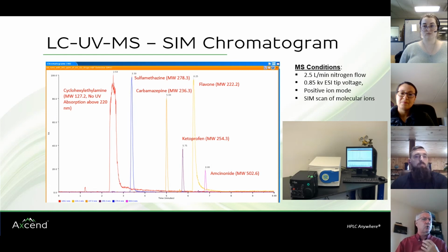And for a nitrogen source, you can use a simple lecture bottle of nitrogen. It's designed for low flow, so you can take it anywhere. A grow house, a field, a sample site where you need to figure out, maybe we're blending our components right on the spot, and we want to know, did we get it right? You can take this right to the blending spot.